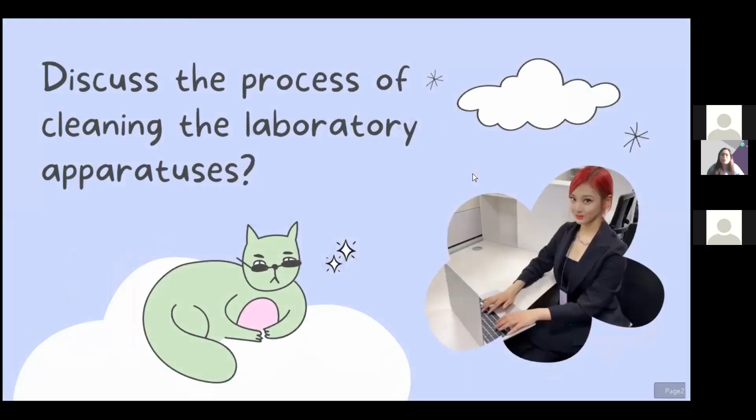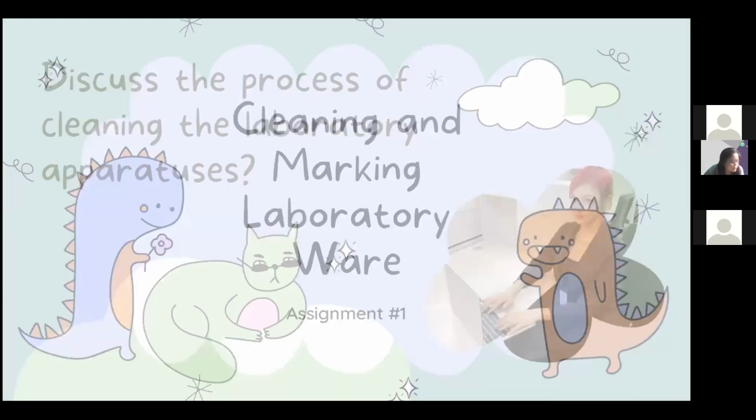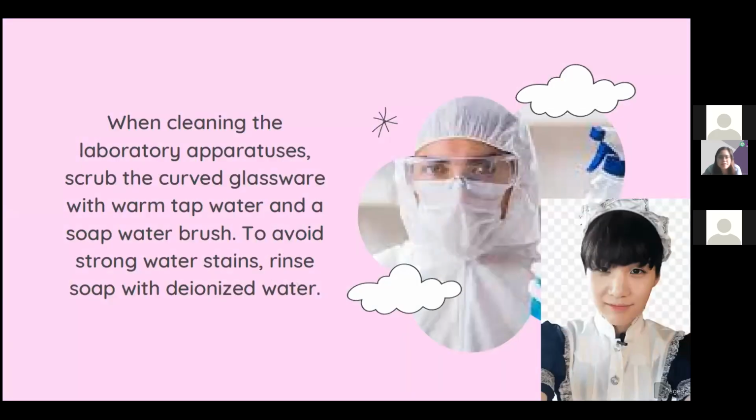Okay, next. Sige. The assignment is actually about cleaning and marking the laboratory ware. So let's have question number 1. Number 1, discuss the process of cleaning the laboratory apparatuses. Let me see your answers.